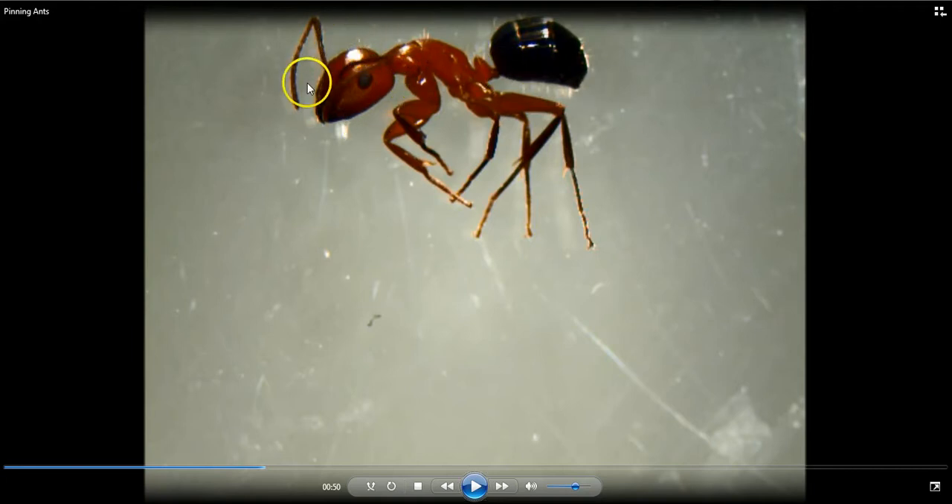This ant is in a really good position here. We can clearly see the head, the mesosoma, and the gaster. Our point would actually go right in this area right here. You can see I've got the front legs forward and the back two pairs of legs backwards, and we're going to insert the point right in there.